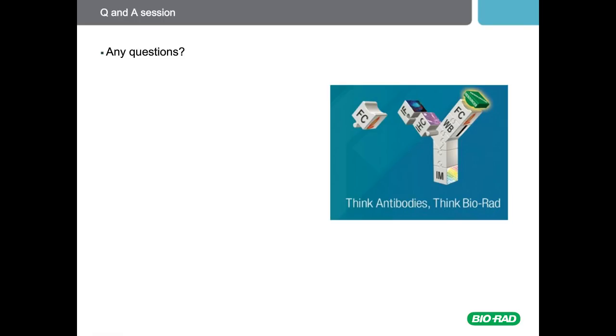And sat above this, in a sort of yellowish plasma, is the plasma which contains the platelets. You can transfer this top platelet-rich plasma layer to a new tube and dilute 1:1 with room temperature buffer. And you then pellet the platelets by centrifugation at 800 G for 15 minutes at room temperature. And again, do this without the brake.